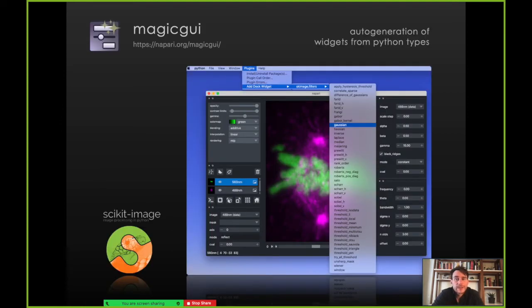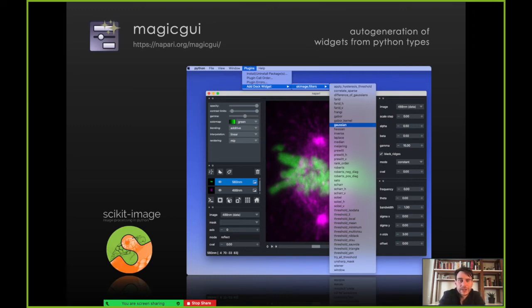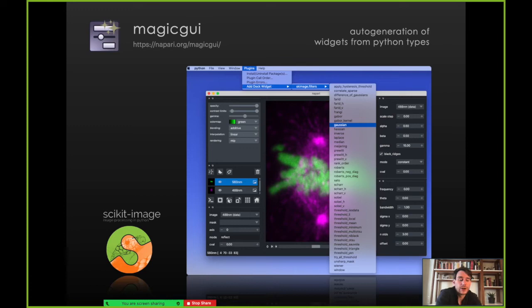We also have MagicGUI, a tool that does auto-generation of widgets from Python types, really spearheaded by Tali Lambert and the community. In this example, we're passing a scikit-image function through MagicGUI and auto-generating a widget that allows you to control some of the parameters of that function. This is really useful if you're developing a plugin but don't want to do a lot of custom GUI coding — you can leverage MagicGUI to auto-generate a widget from your functions.